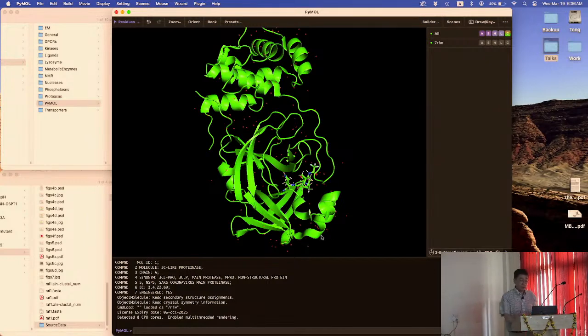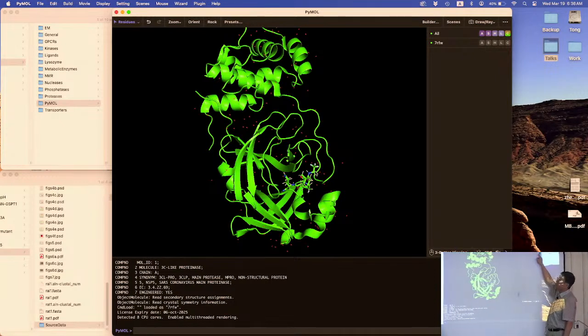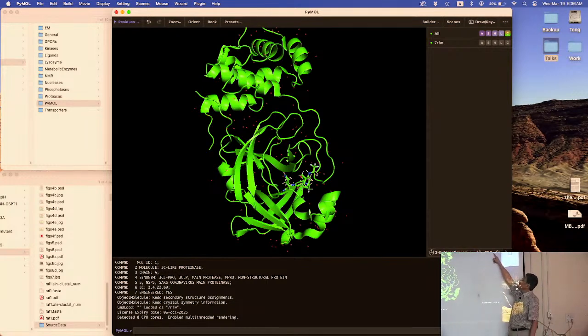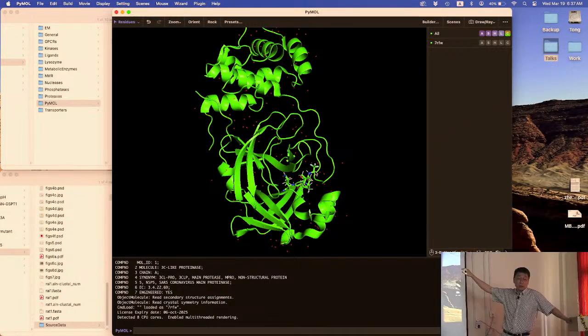Okay? And then each structure, when you open it, gives you a line here, and there are 5 options on that line. A means action, S means show, H means hide, L means label, C means color. So that's how they are labeled. Based on the letter, you know what's underneath that. You can click on that, and it gives you the options.